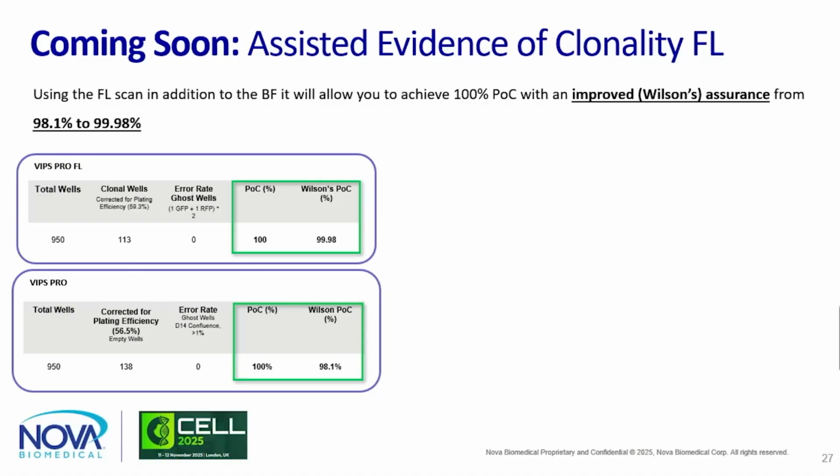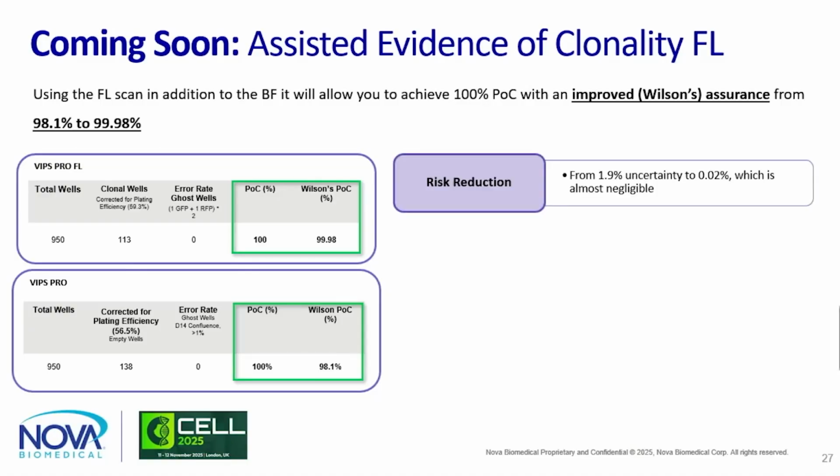You might think that this is a small difference, but it's actually a big risk reduction. From 1.9% to 0.02%, it's nearly negligible.